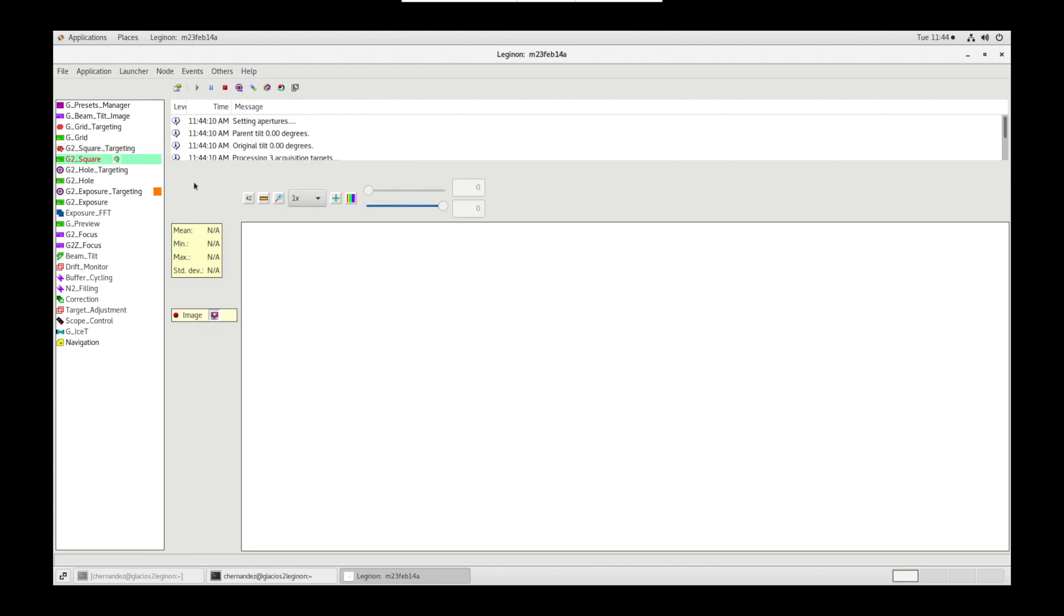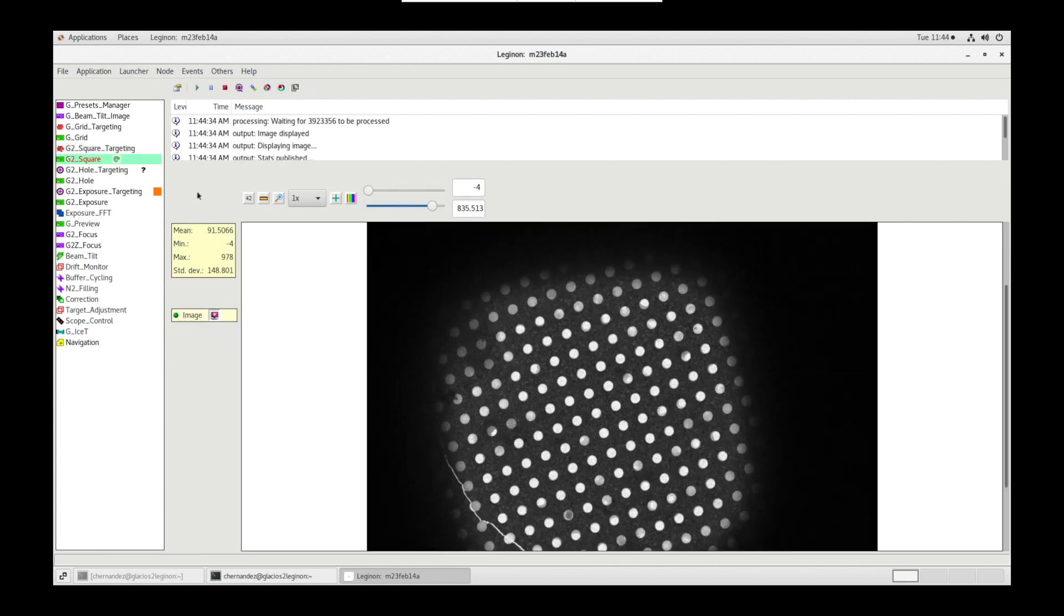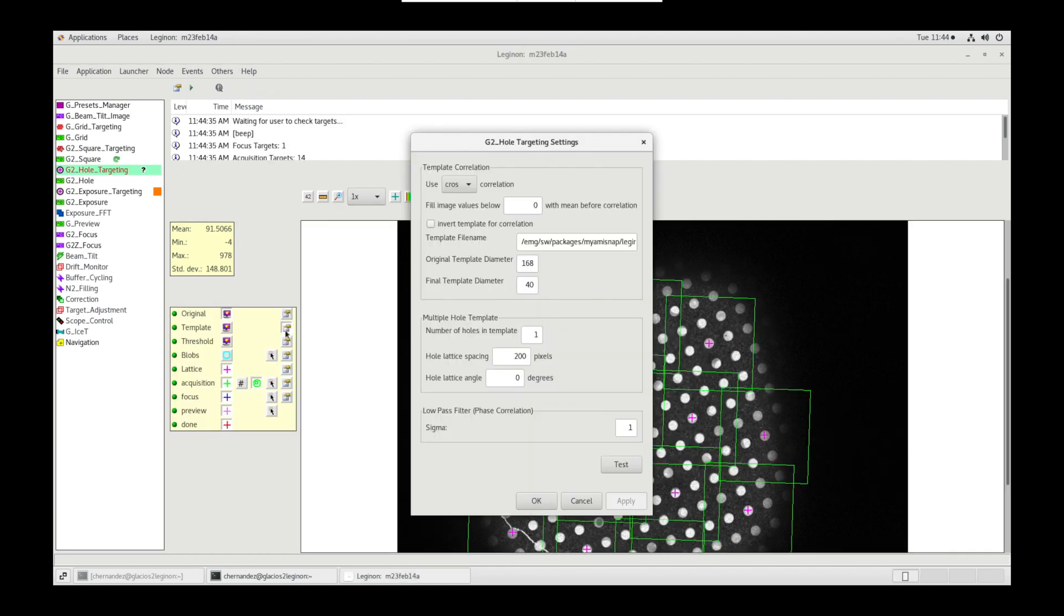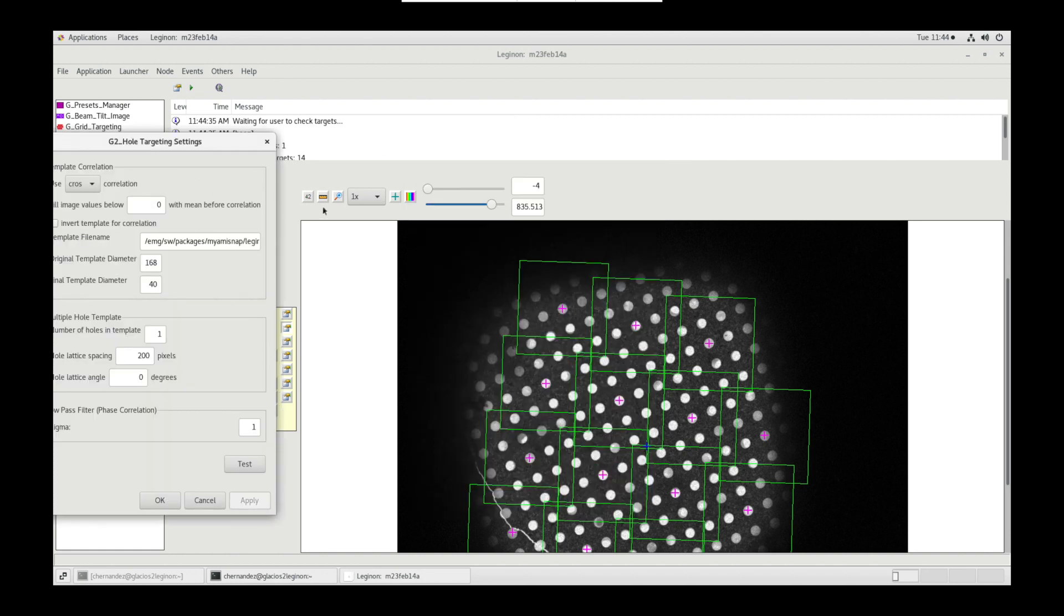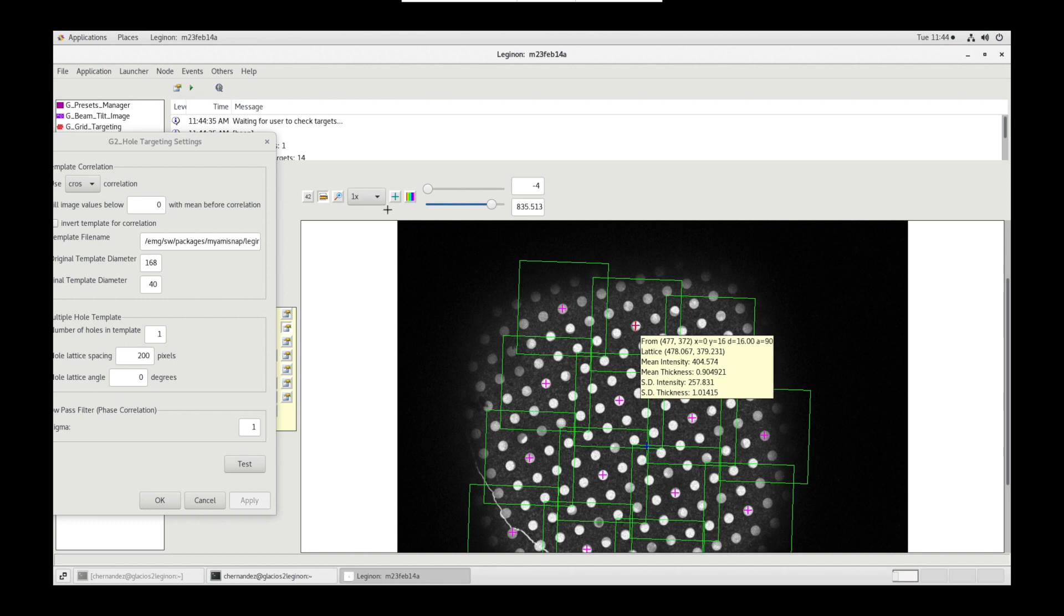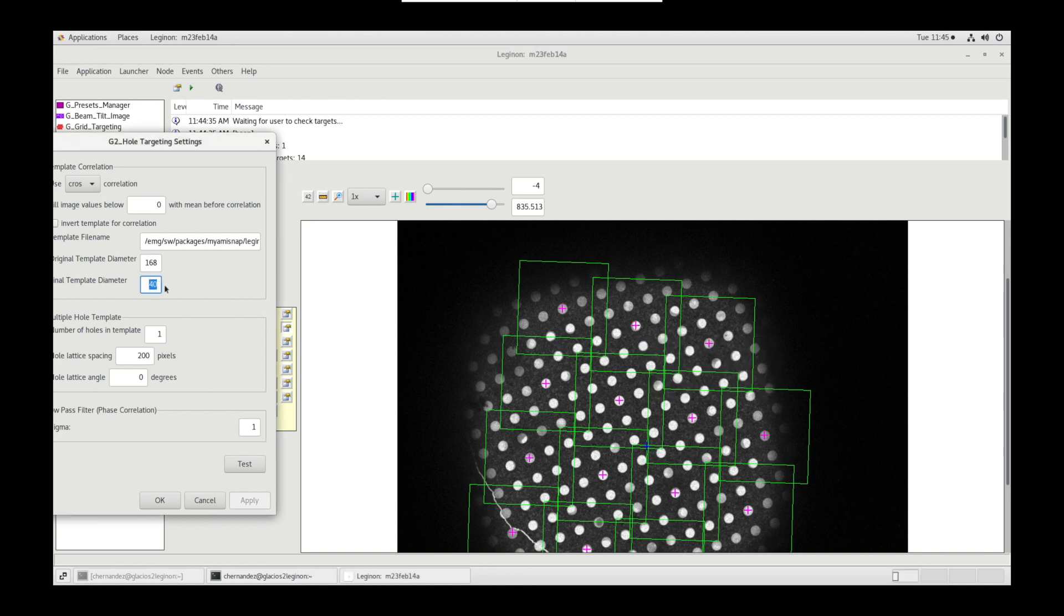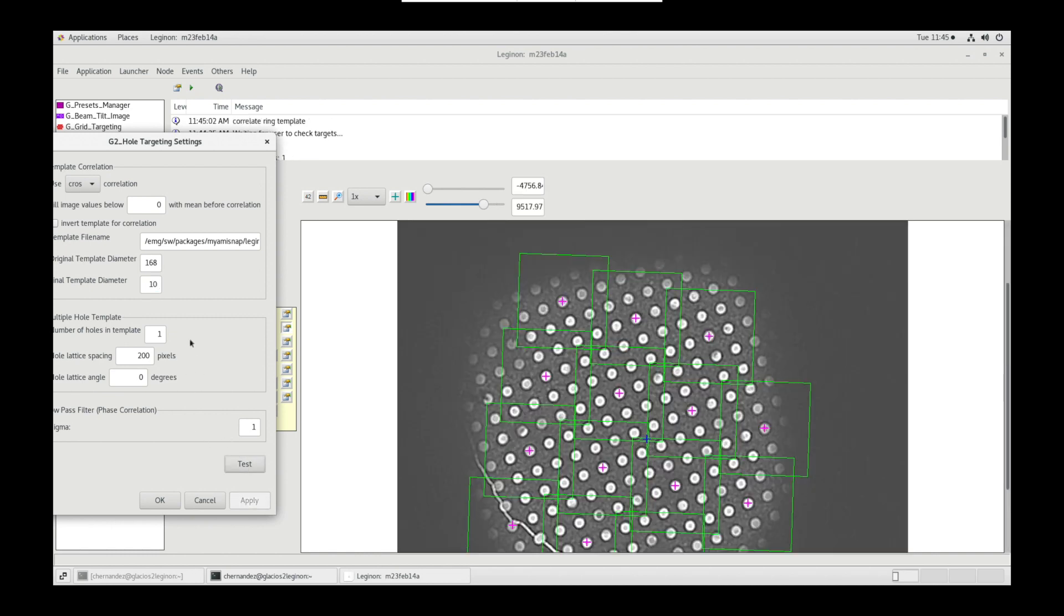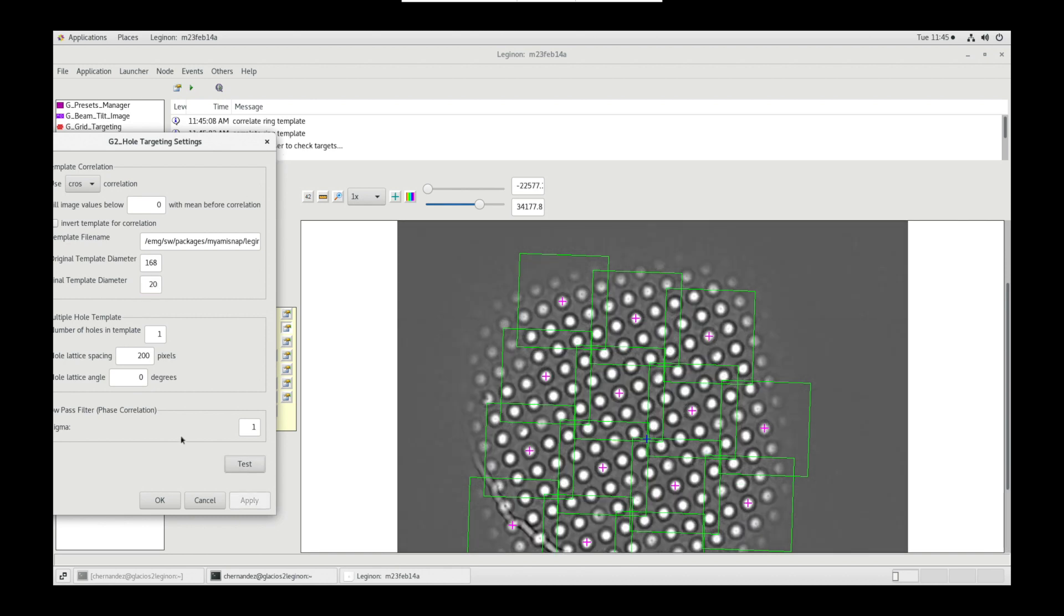Square node will take an image at square lm magnification. Whole targeting node will generate the same image for targeting. Open template settings and use the ruler tool to measure the diameter of a hole. Input this value into final template diameter and test. All holes should have bright white peaks. If it doesn't change the value and test. Once satisfied, click OK.